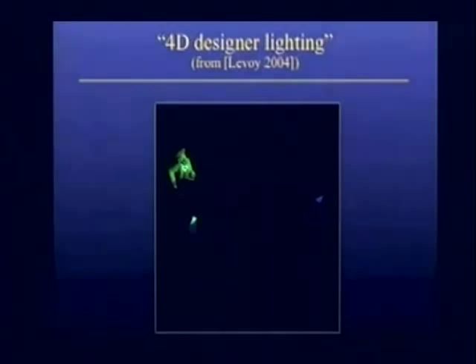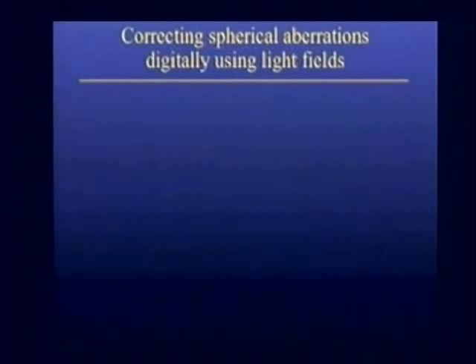By analogy, we ought to be able to do the same thing microscopically as well. Remember, all the light's coming through the plant from this light field created by multiple video projectors here. So it seems like there might be a lot of possibilities. All right, so the other application I'll spend the most time on is the spherical aberration correction.